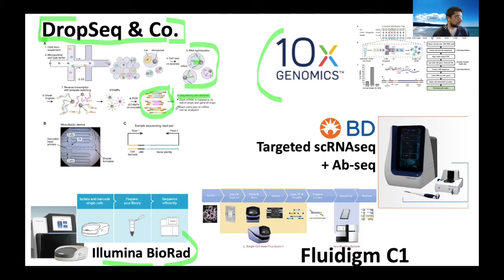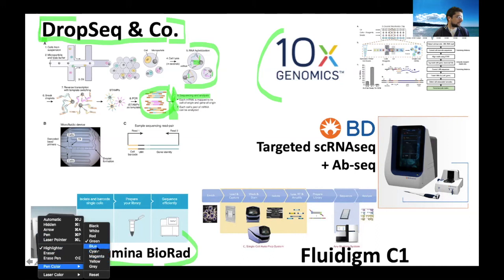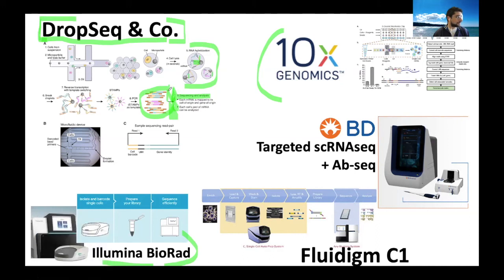Okay, so these are different from the barcodes that we've seen before on the adapters. These are just different barcodes. These are cell barcodes, not sample barcodes. But these are giving you the information of what is the origin of the fragment. What is the origin of this transcript? What cell was it coming from? So you have different origins.